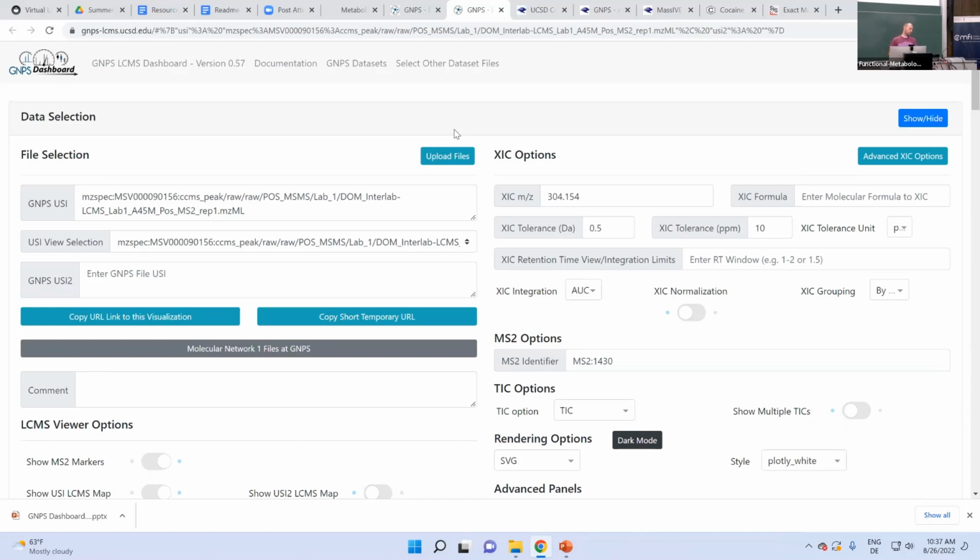Yes. So that's actually a new thing for MassIVE, that the user accounts have only 100 gigabytes of long-term storage. Before it was unlimited, but I think because people kept a lot of files in their private space, that's not what it's meant for, right? So they recently put a long-term limit there. That does not apply for public data sets. So if you upload whatever data set and then make it public, there's no limit.